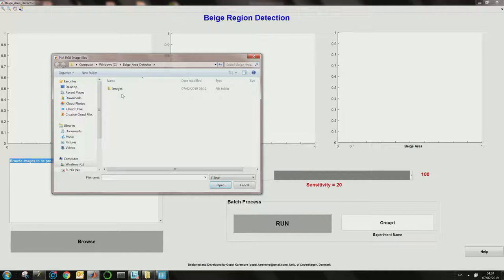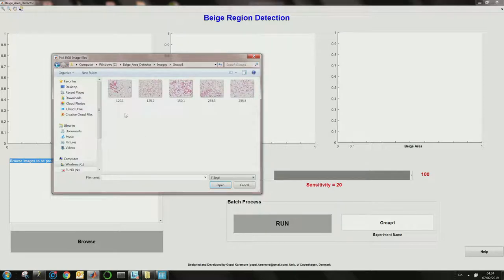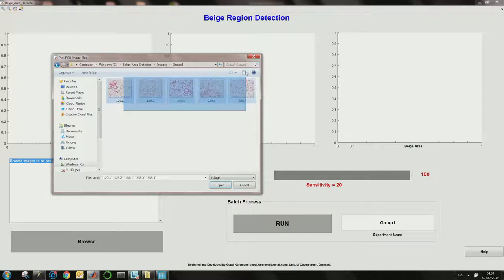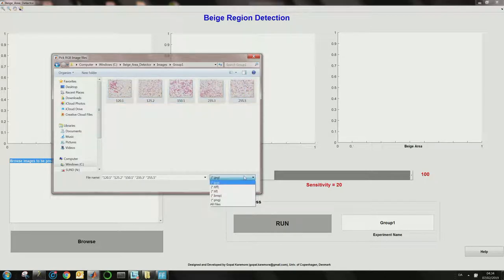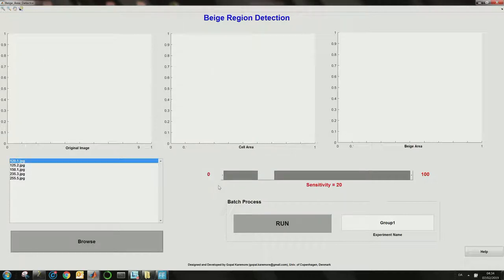The pop-up window will look for the location of the images that you want to process. The user can select one image or multiple images with the mouse. The software supports different image file formats. I'm selecting multiple images and all the images will be loaded into the list box.